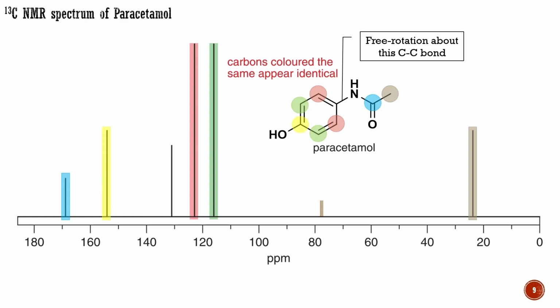You may ask, why is one of these aromatic peaks in the carbonyl group region at 153 ppm? Well, this must be C4 as it is bonded to oxygen. A reminder that carbonyl groups are not the only unsaturated carbon atoms bonded to oxygen.